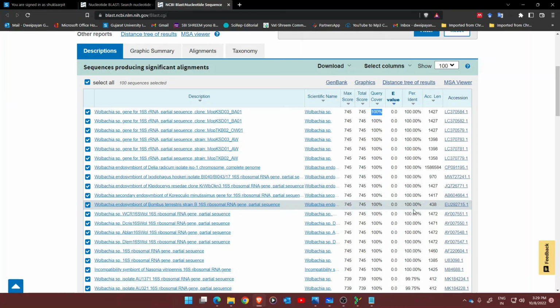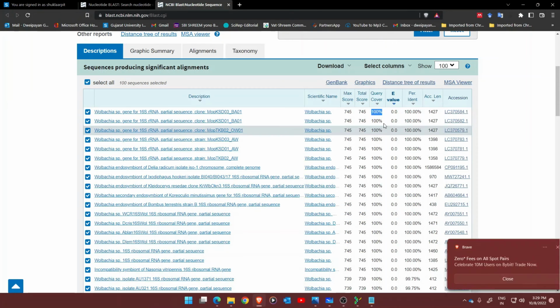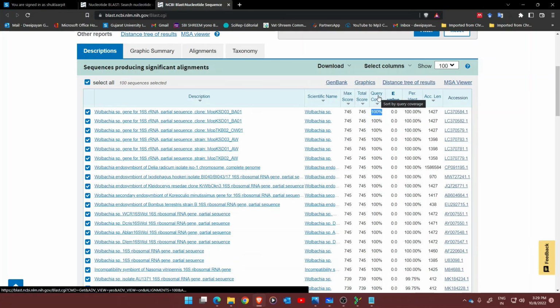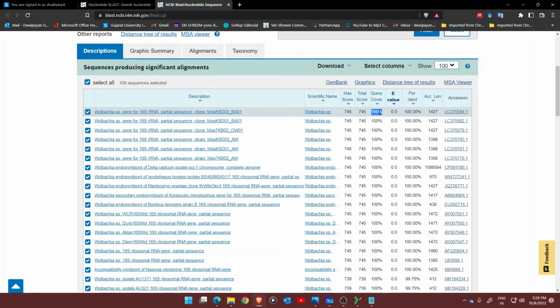Okay, so when you are trimming your sequences, your forward primer and the reverse primer, if you have not trimmed it well, or if the quality of the sequence provided to you is not good and you are trimming it not in a correct way, then despite the percent identity being high, make sure that your focus is first on the query coverage. Okay, so you go back again, trim your sequences, make sure that first you reach the point where your query coverage is 100%, and once you reach this point, then you look at percent identity.